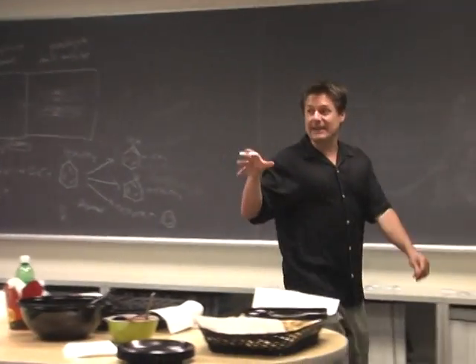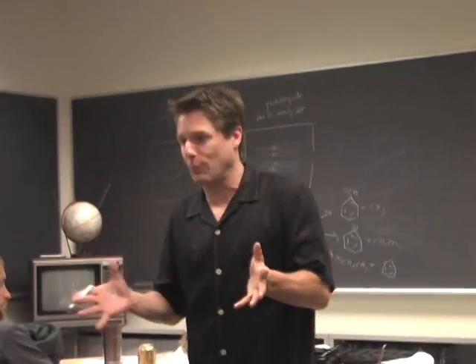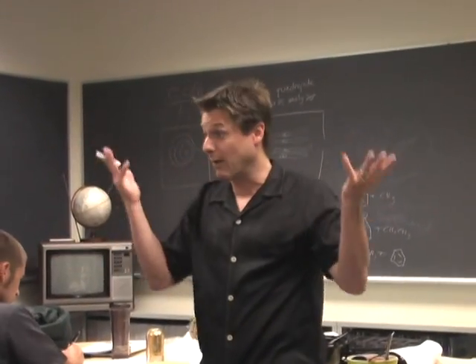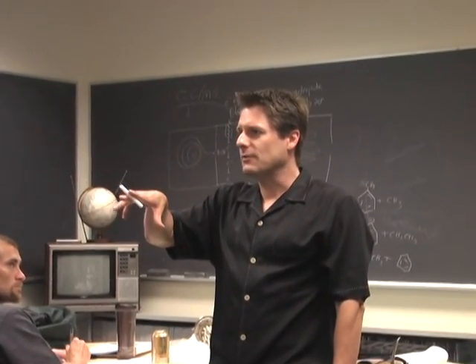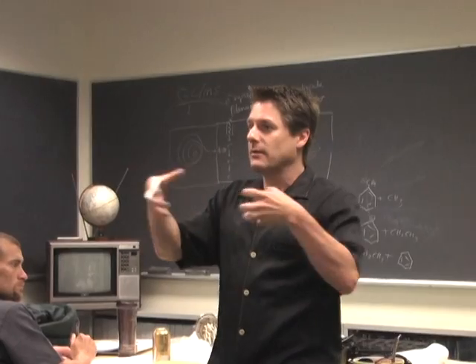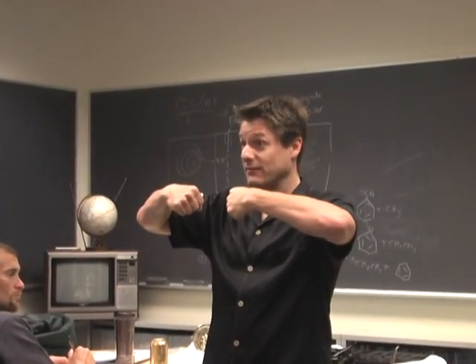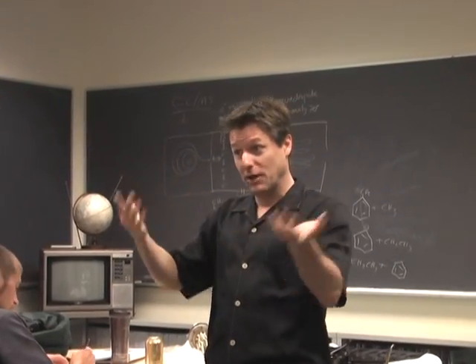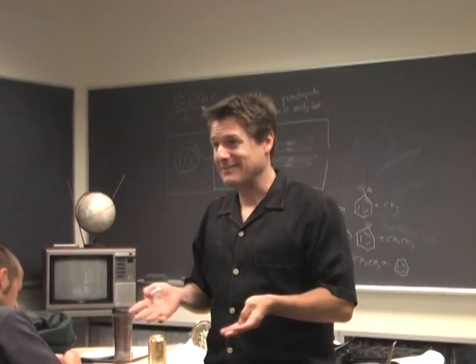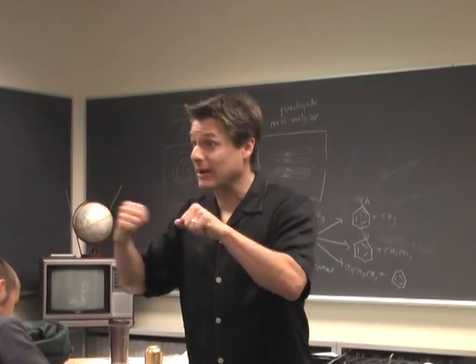Now, to understand this, which seems fairly complex, I'm going to break it down to just 2 basic non-chemical principles that you could probably teach to any 7th grader, I would imagine. Didn't you guys teach 7th or 8th grade? Do you talk about electrostatic attraction? Like charges, what happens when you get 2 positives? Yeah, they repel; positive and negative attract. That's one of the 2 principles you need to understand how a quadrupole mass analyzer works. Opposite charges attract, like charges repel.